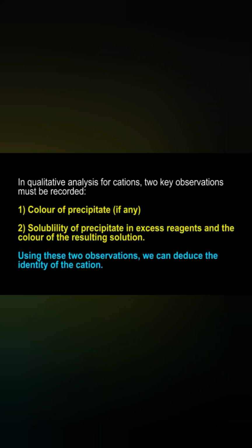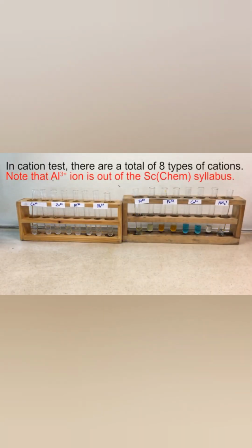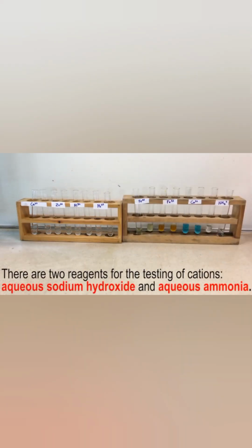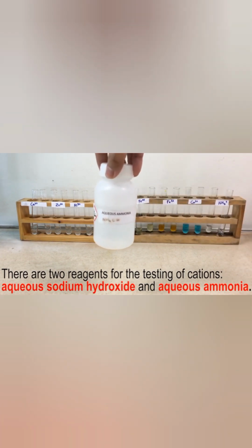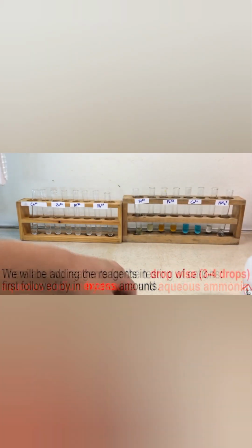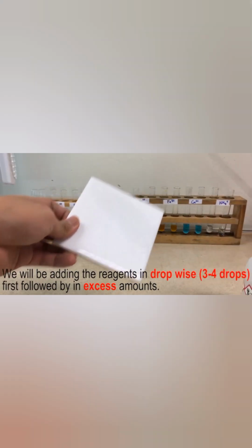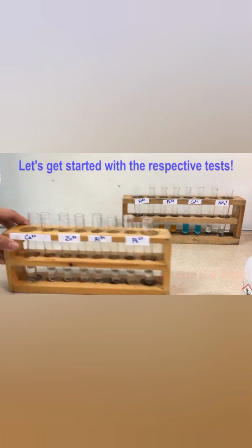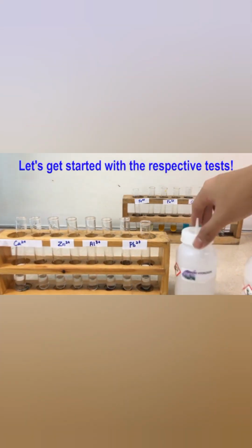Now, in qualitative analysis of cations, we have two key observations to be recorded: the color of precipitate, if there is any, and the solubility of precipitate in excess reagent. I'll be looking at calcium ion, zinc ion, aluminum ion, and lead ion, and we'll be using two reagents, aqueous sodium hydroxide and aqueous ammonia, to test the cations, both in drop and in excess. We'll be using separate test tubes for the two reagents. So let us go ahead with the respective tests.